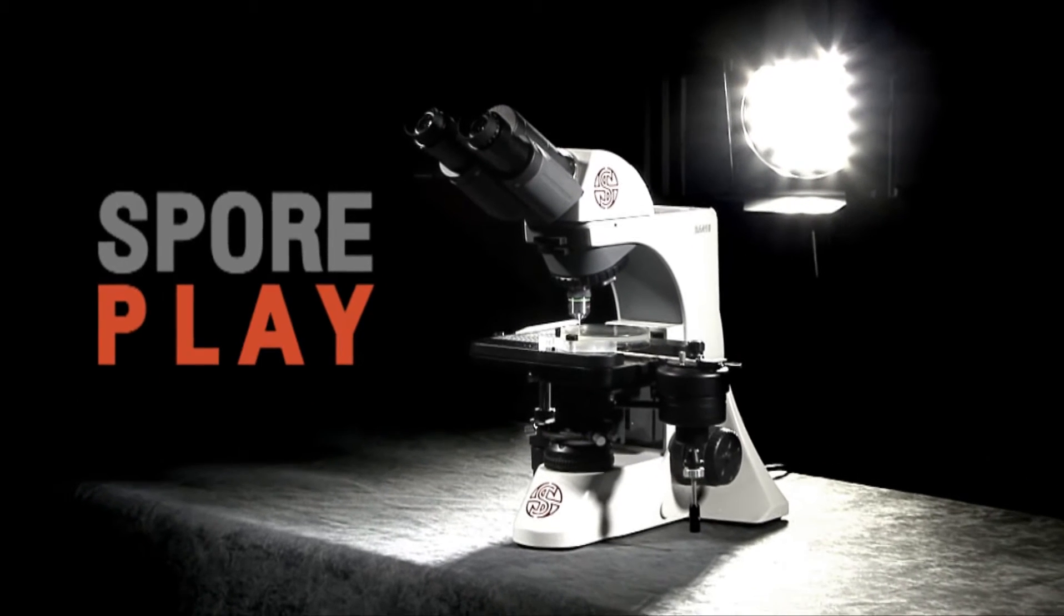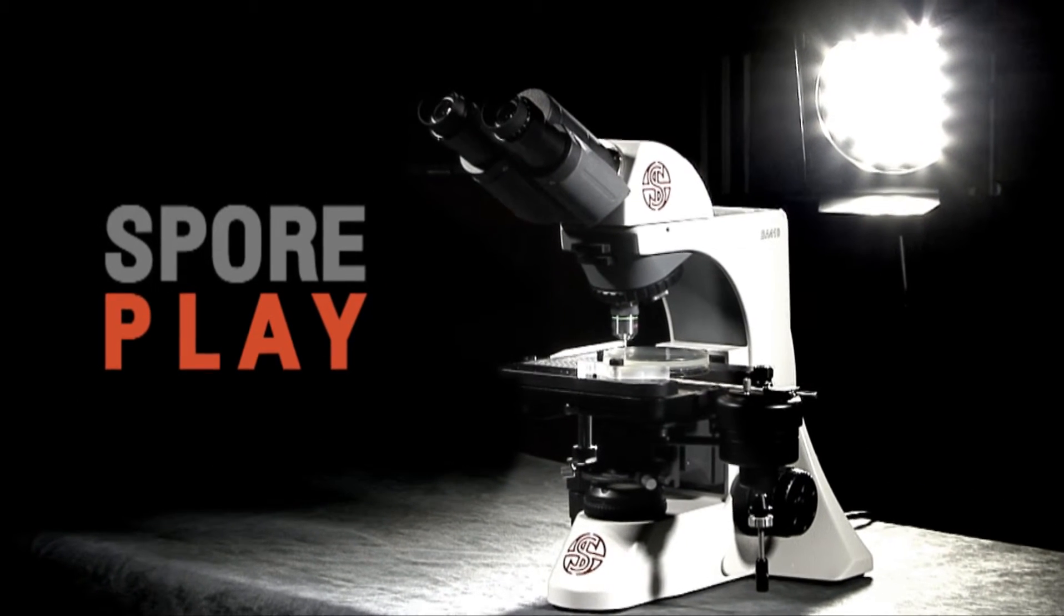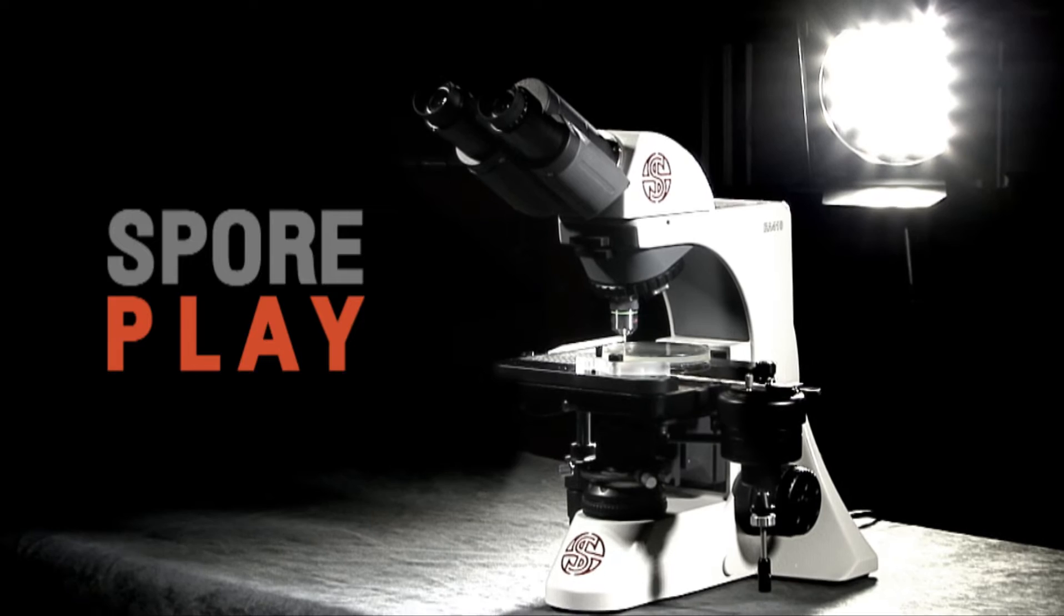Presenting the Sporeplay, the world's sexiest manual yeast tetrad dissection scope.